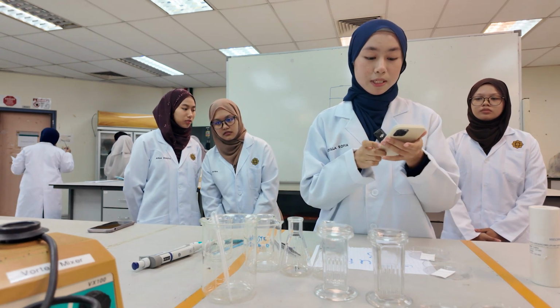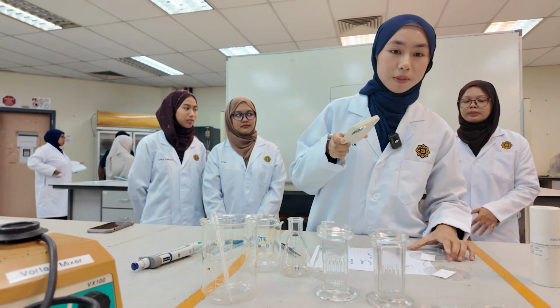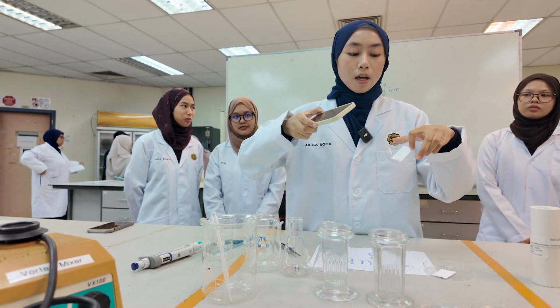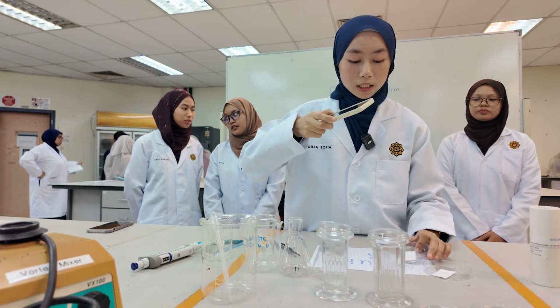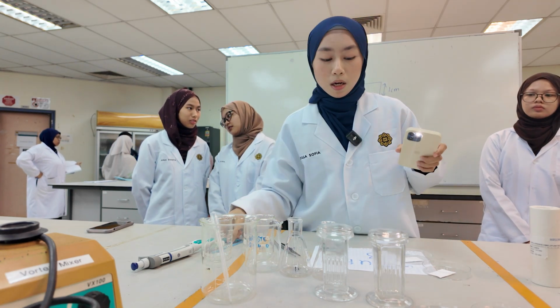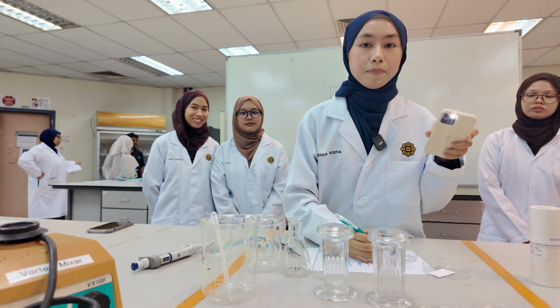Assume this is a UV light. We can visualize the spots and gently outline the spots that we see through the UV light.